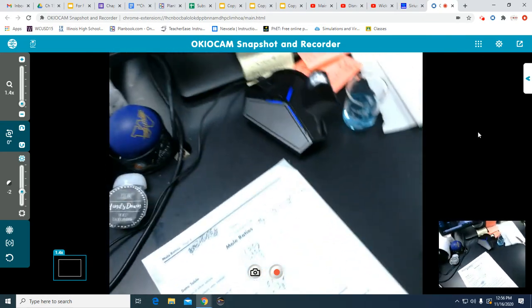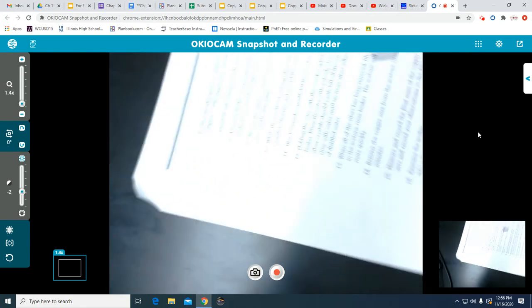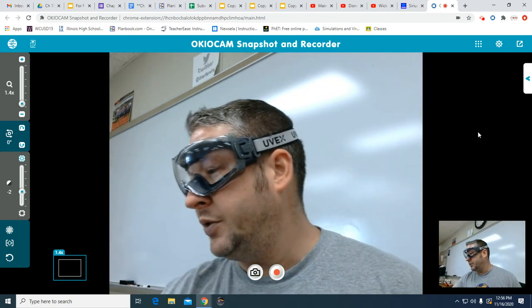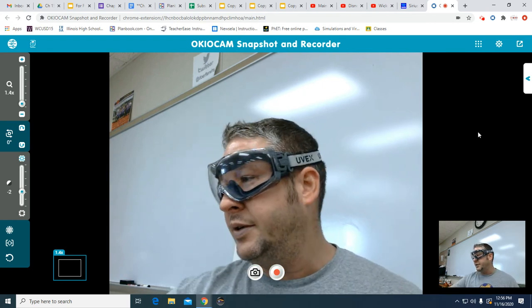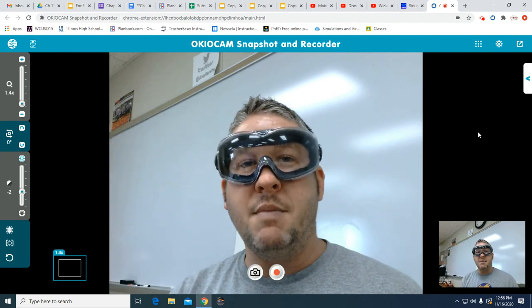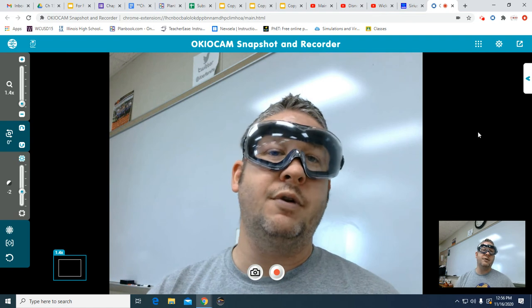One of the last few things we need to do today is, on my end, dispose of the waste solutions. I need to dispose of the initial solution that had the nitric acid in there, which is why I've got this decanter, so I'll be dealing with that. Tomorrow, we will come back and measure the mass of the dried-out silver, record that data, and then you will be off and running on your post lab.